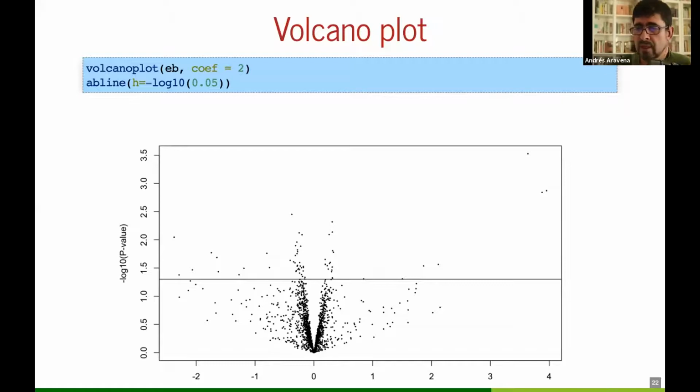So to me, it's super confusing. And when I speak with the experts, in fact, they say, we have no idea. So there are different rules. Of course, the higher the log fold change, the more sure you are that they are significant. I will say that these three here certainly have a good statistical and good biological reason to be interesting. But the ones here are not clear.